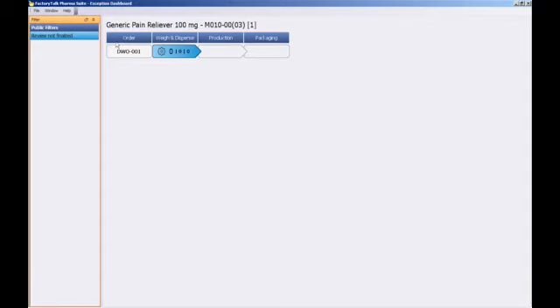Before we continue, let's look at a possible scenario. I am now an employee responsible for quality aspects. While in my office in the Quality Assurance Department, I'm checking what's happening on the shop floor by watching the PharmaSuite Exception Dashboard. As I mentioned, the weigh and dispense capability of PharmaSuite is within the EBR framework. The Exception Dashboard is the tool that will be used by the quality personnel to perform a real-time review of both executed or running shop orders.